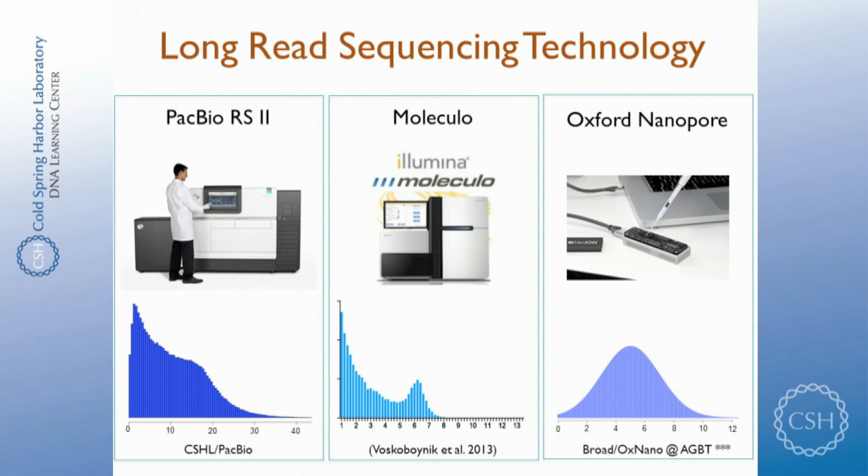The very new technology that's just starting to be announced is this nanopore technology from this company, Oxford Nanopore. The nice part of this today is that it's extremely mobile, right? It's a thumb-sized device. You can walk around. You can take it to remote labs.